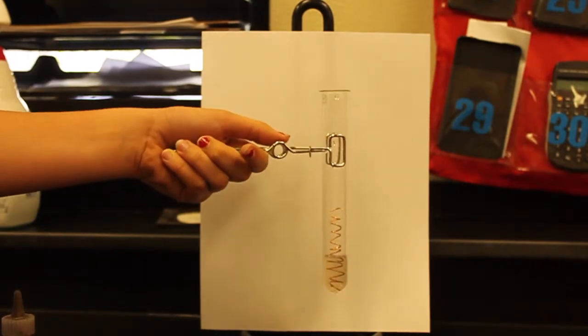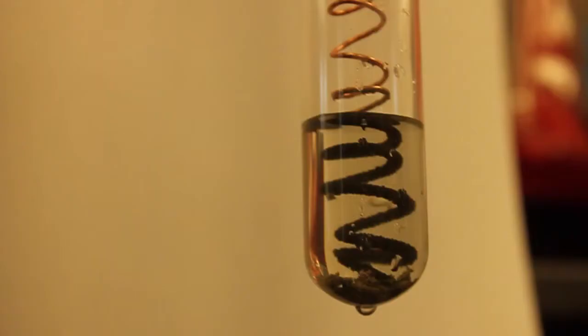Quickly the copper reacted with the AgNO3 to create a single replacement reaction. Silver quickly gathered on the copper as a solid and the copper NO3 became an aqueous solution.